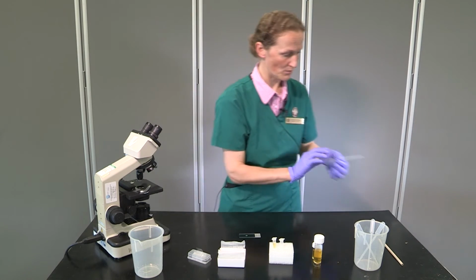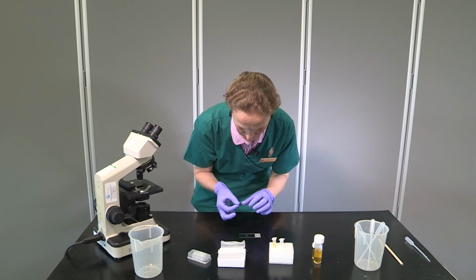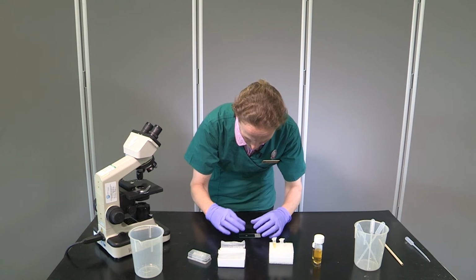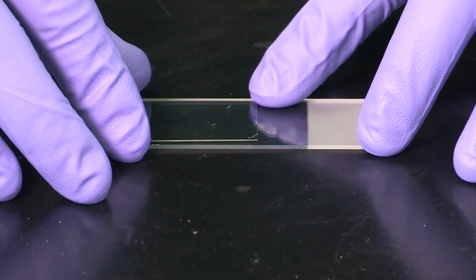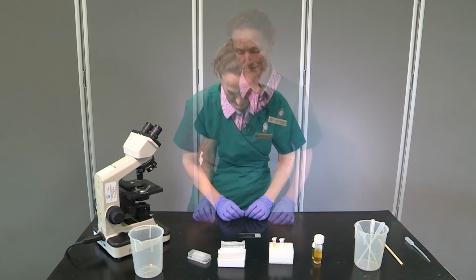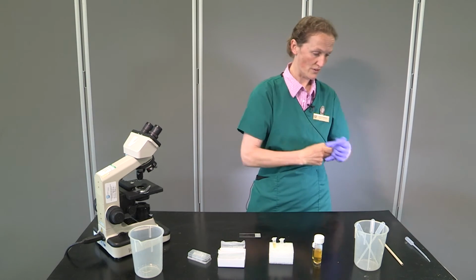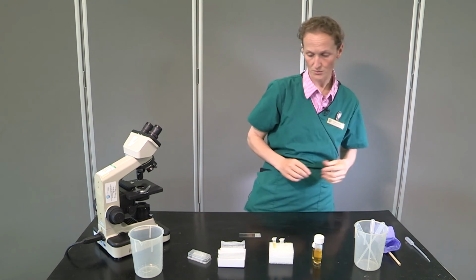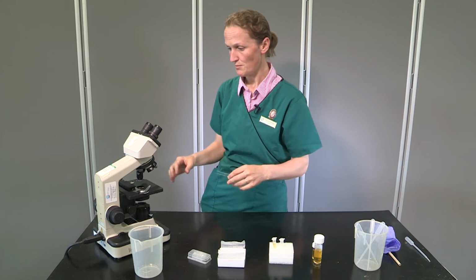I'll put this in clinical waste and take my cover slip and gently drop it over the top, trying to avoid any air bubbles from appearing in the middle of the slide. There we go. So I'm going to use my microscope. I'll take my gloves off first, place them in clinical waste, and then take my slide to the microscope.